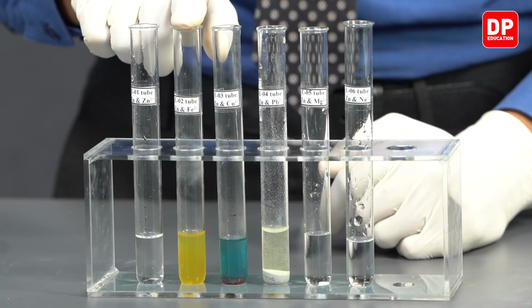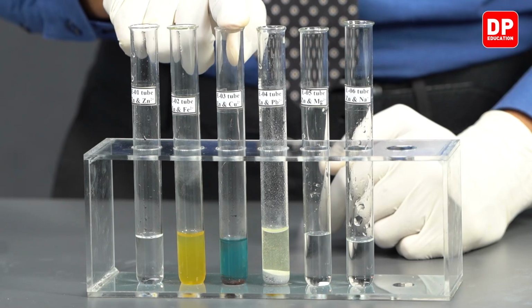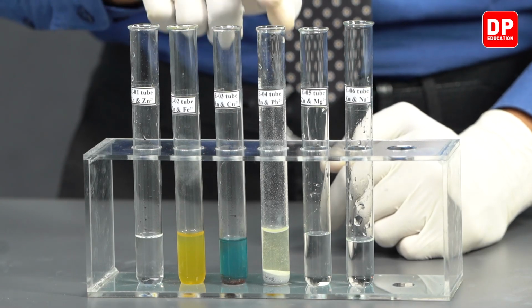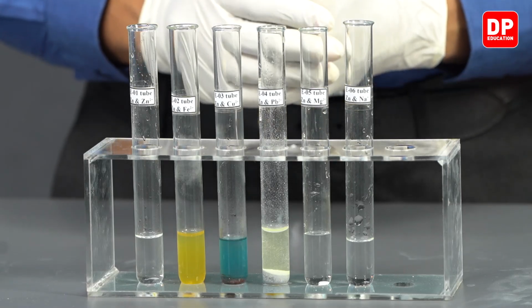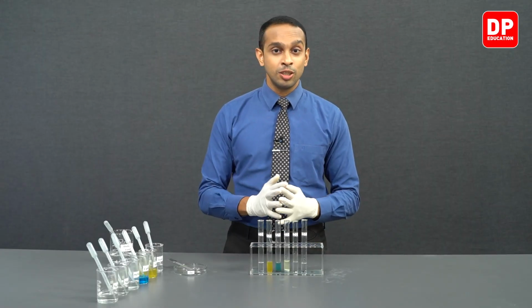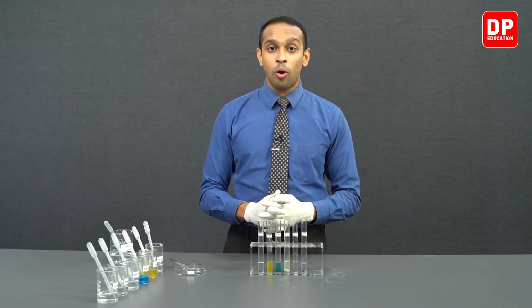So ferrous, copper and lead ions were displaced by zinc, indicating zinc is more reactive than all 3 of these metals. Iron, copper and lead are all less reactive than zinc.